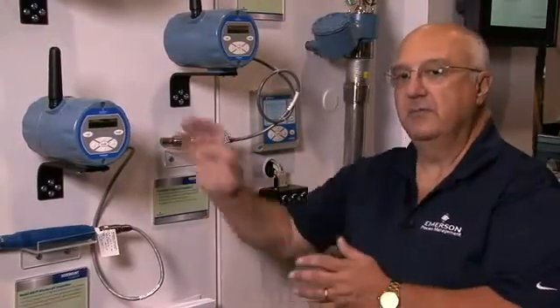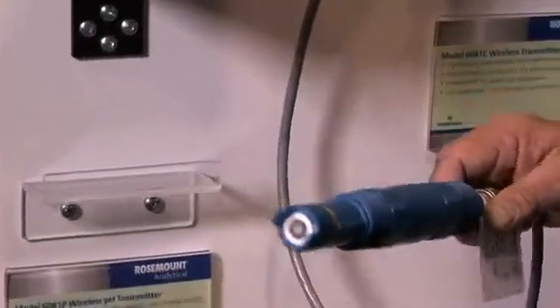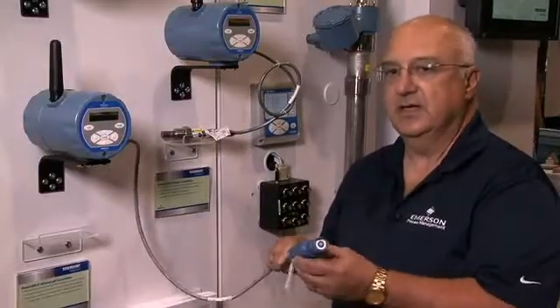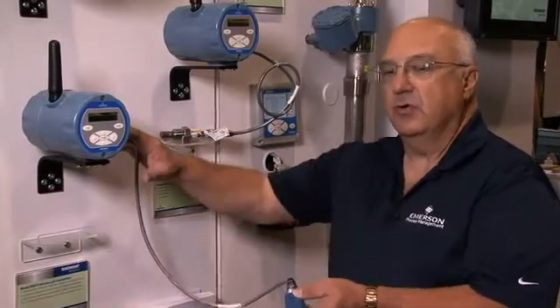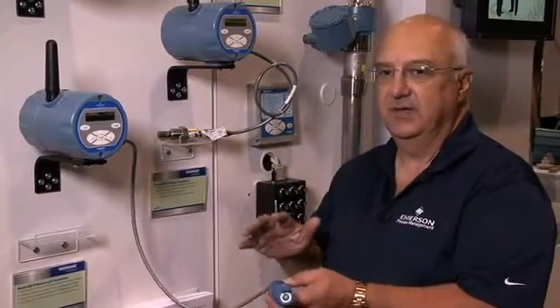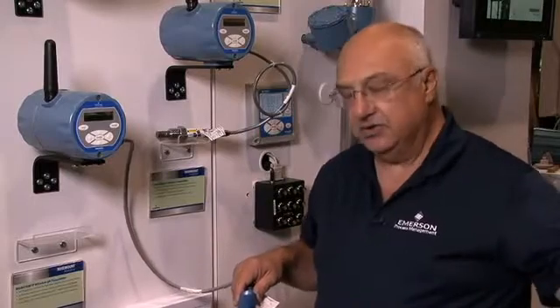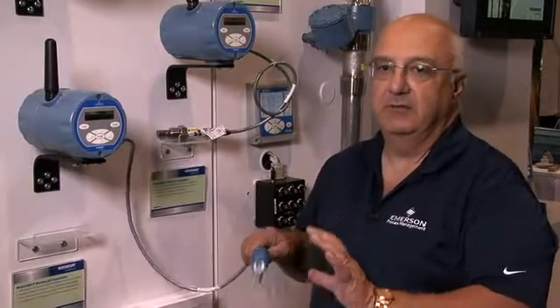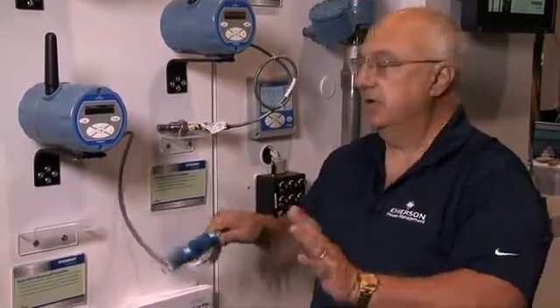Another unique feature of the pH transmitter, as you might have heard on our product roadmaps this week, is the smart pH sensor. This transmitter uses the smart technology, looks at the calibration data that's in the pH sensor itself, records it in the instrument, and stores it, automatically calibrating itself in the field. So you no longer have to carry buffers out into these harsh areas or do any calibration in the field. The instrument automatically remembers the calibration that's in the sensor, records it, and you're off and running.